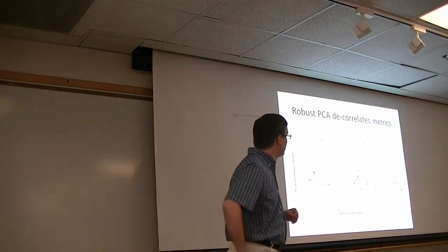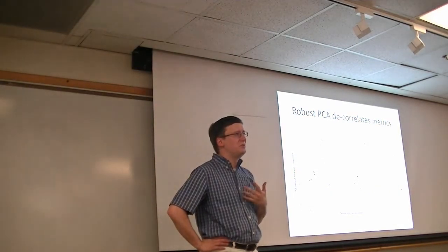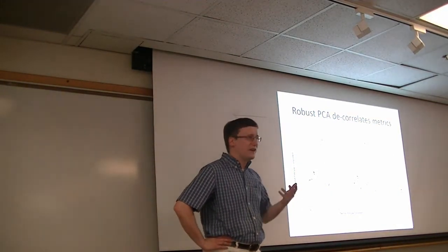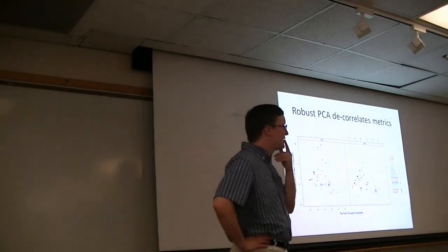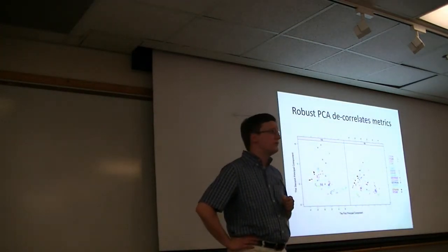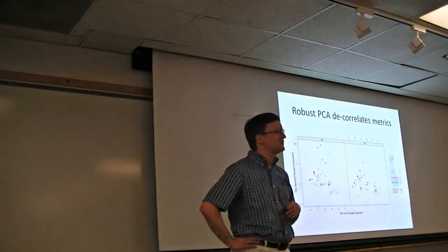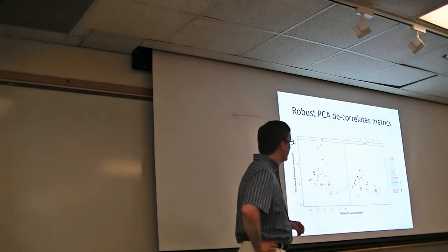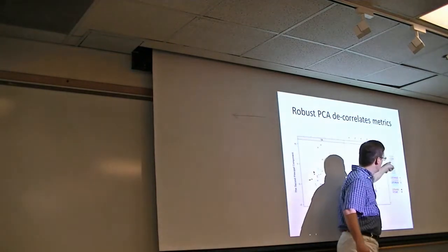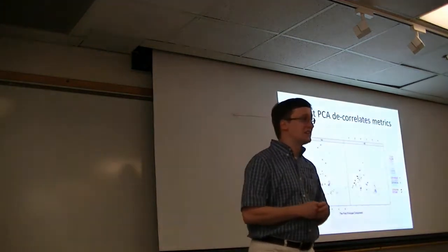So when we've processed large-scale experiments this way, we've been able to evaluate variability a lot more sensitively. So the experiment we're looking at right now is study 1 from the CPTAC. This was produced back in late 2006 and early 2007. And each one of these little symbol types represents a different instrument that was included in that study.